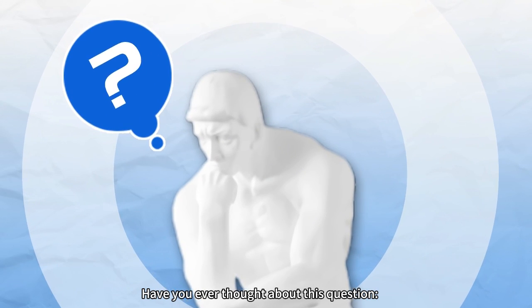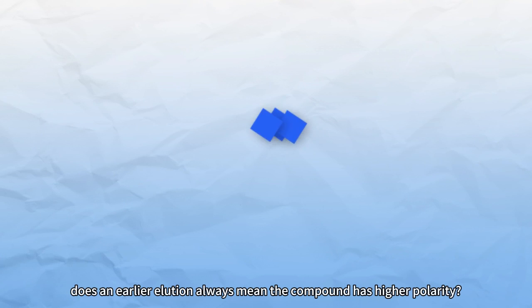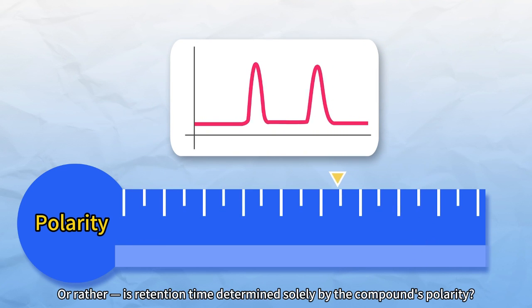Have you ever thought about this question? In reversed phase chromatography, does an earlier elution always mean the compound has higher polarity? Or rather, is retention time determined solely by the compound's polarity?